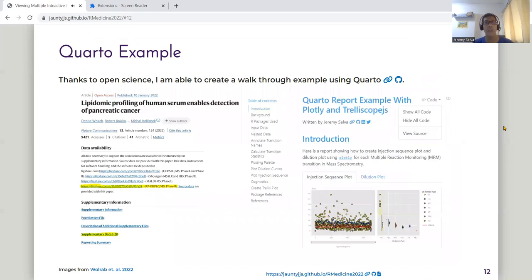Now that I have given my reasons why I use these two packages, I would like to now share some tips and resources that will help you guys to be able to give these plots by yourself. Thanks to Open Science, I am able to create a walkthrough example using Quarto, using a published lipidomic data set.